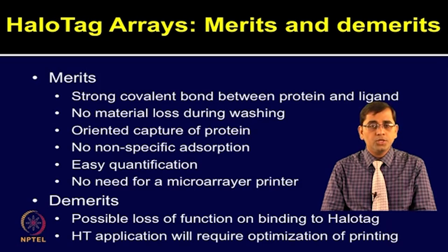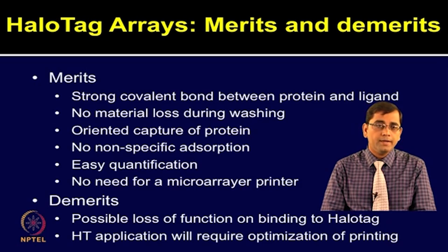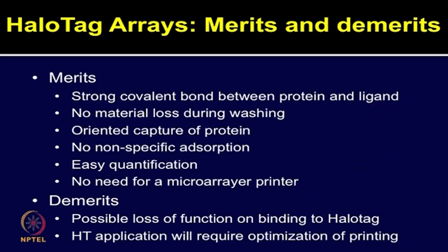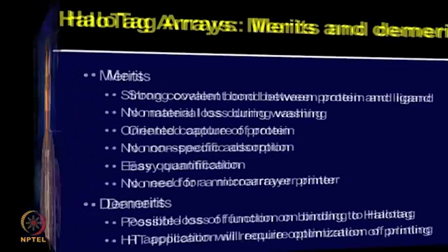However, there are certain limitations of using Halotag arrays. It has not been shown that the system can be used for high density arrays. Also, only few spots using the commercial gaskets have been shown. So, applicability of this technology for high density protein microarrays is yet to be seen.